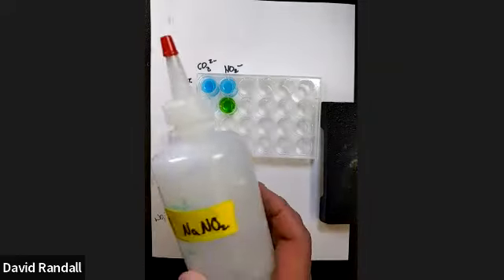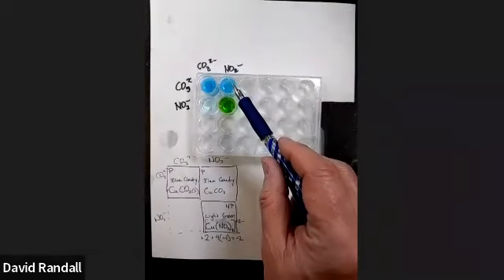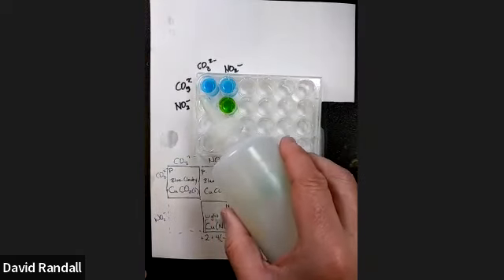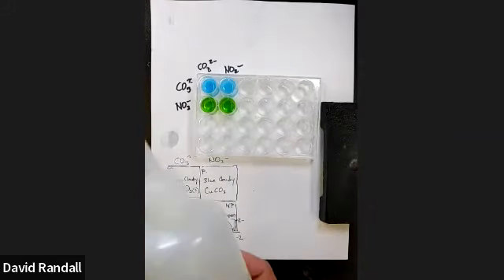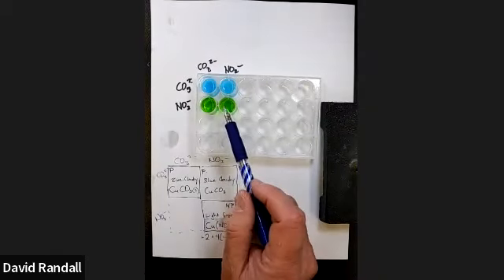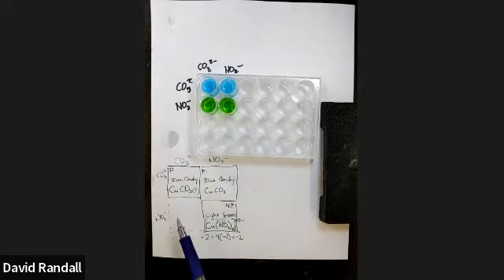So in this case, I'm going to add the sodium nitrite first. Remember, in this well, we added the sodium carbonate first, and it never changed colors. So here I'll add the nitrite. 1, 2, 3, 4, 5, 6. Okay, so there we've got 6 sodium nitrites in there. And it made the green color just like we expect. There's only 2 things in this well right now, only the nitrite and the original copper. So what's in there now should be this substance here.